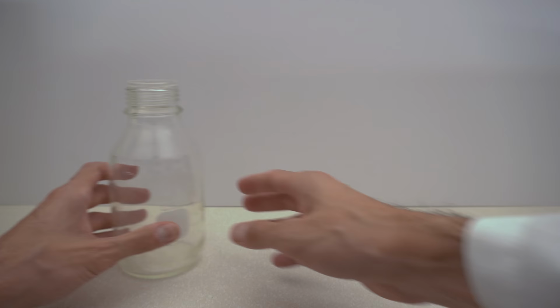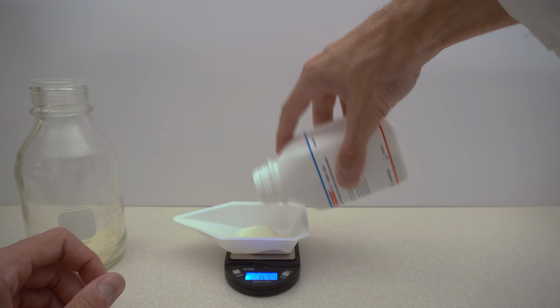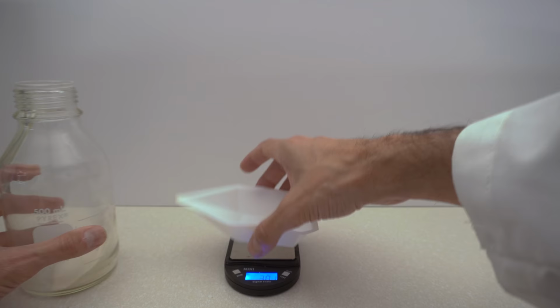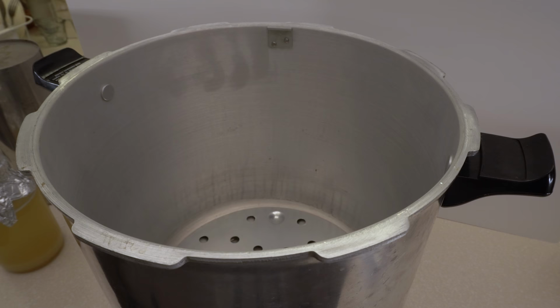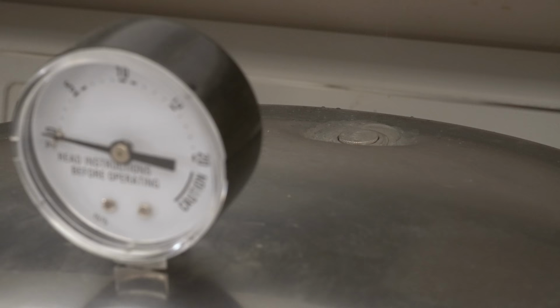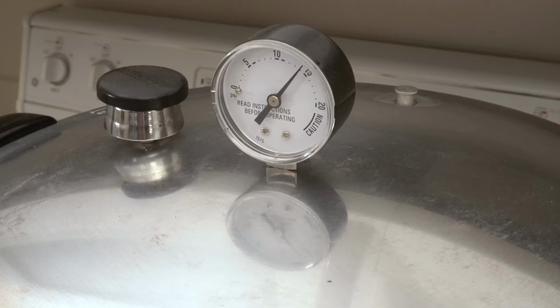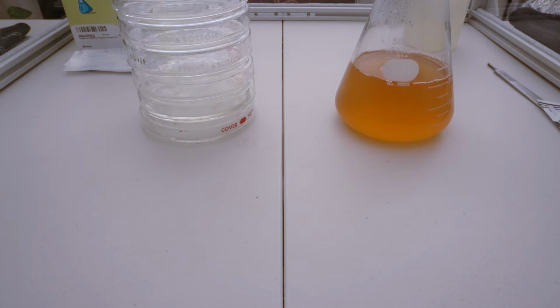Now let's make a malt extract agar medium that will be used to isolate the mushroom cultures. Both the medium and glass petri dishes need to be sterilized by pressure cooking for 30 minutes at 15 psi. After pressure cooking, we can pour the plates in the flow hood and allow them to cool and solidify.